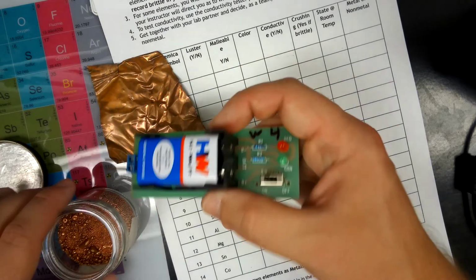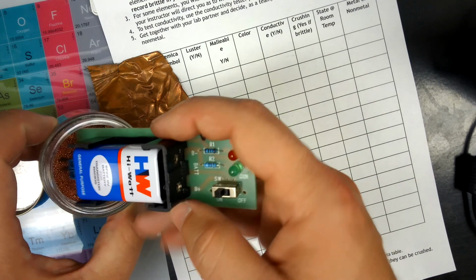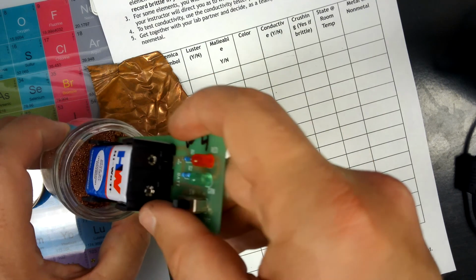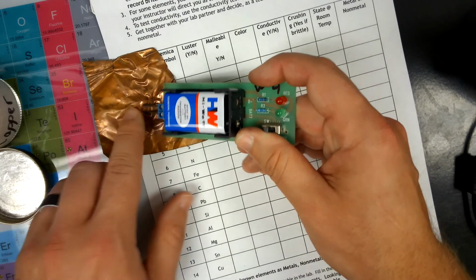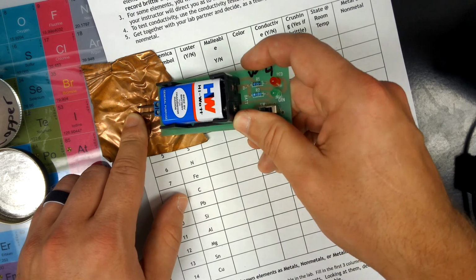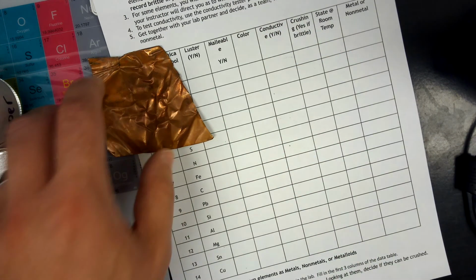And then for conductivity, we'll do both here. See, the little pellets aren't very conductive. This should light up if it's conductive. I can get it to light up once in a while when things hit just right. But with the sheet, I can get it to light up a lot more consistently. Actually, copper is so conductive, it lights up both lights. That's how we get our conductivity, by how many of the lights light up.